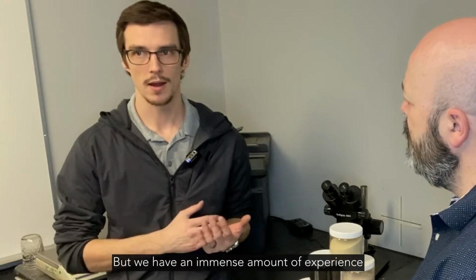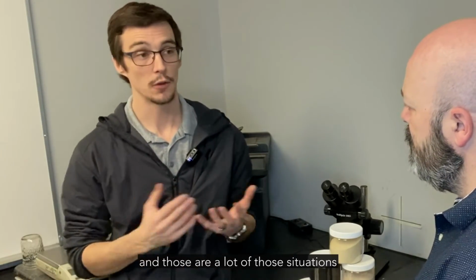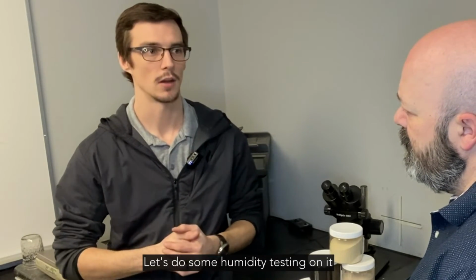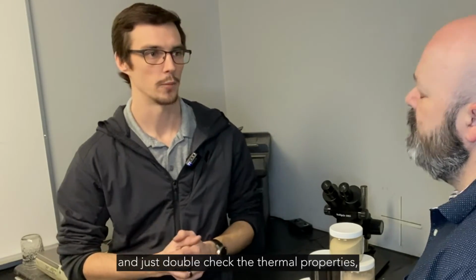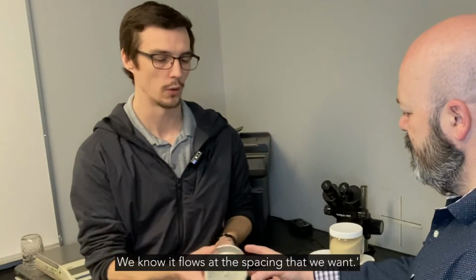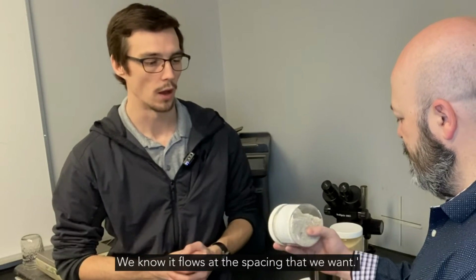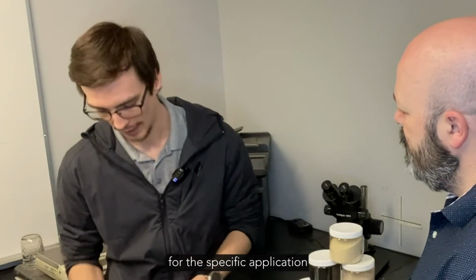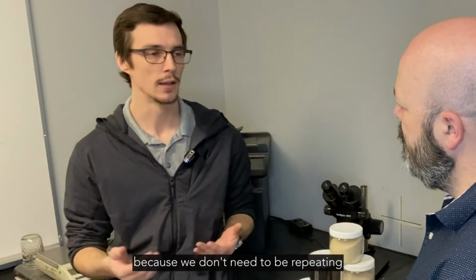But we have an immense amount of experience testing different types, and those are a lot of those situations where we say, hey, send this stuff in, let's do some humidity testing on it and just double check the thermal properties, but we don't need to flow test because it's just another NPK granule. We know it flows, at the spacing that we want. So that's some of those times where we tailor what we need for the specific application, because we don't need to be repeating the same tests.